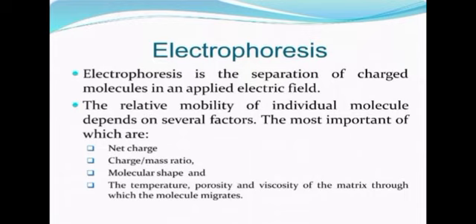Electrophoresis is the separation of charged molecules in an applied electric field. It helps to separate the charged molecules by using the electric field, that is called electrophoresis. The relative mobility of an individual molecule depends on several factors, the most important of which are net charge, molecular shape, temperature, porosity, and viscosity of the matrix through which the molecule migrates.